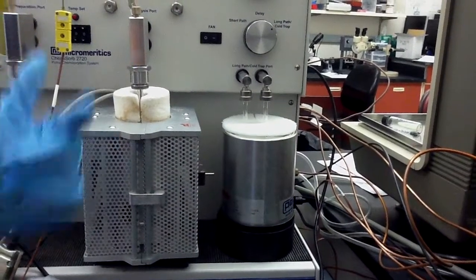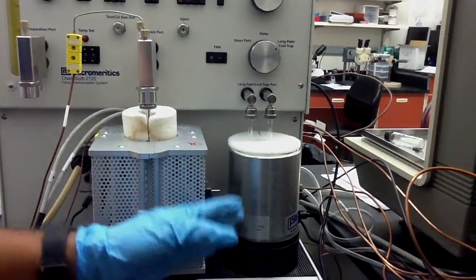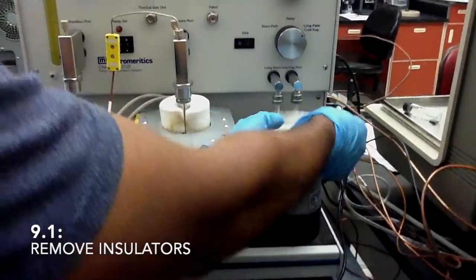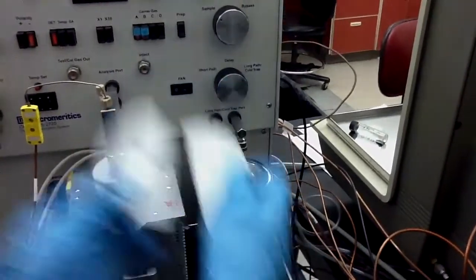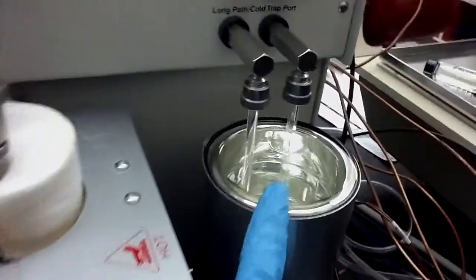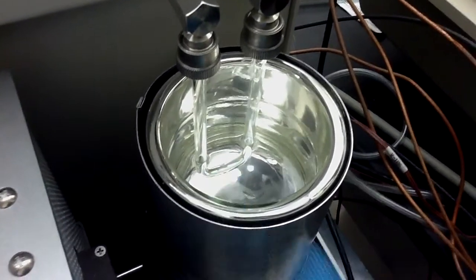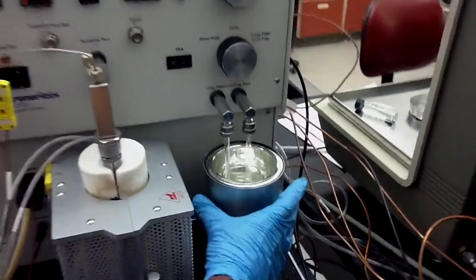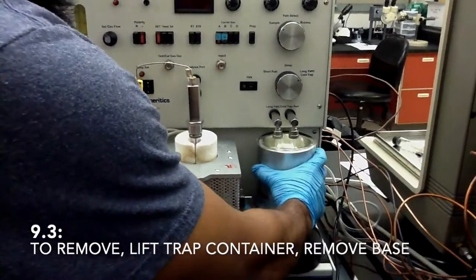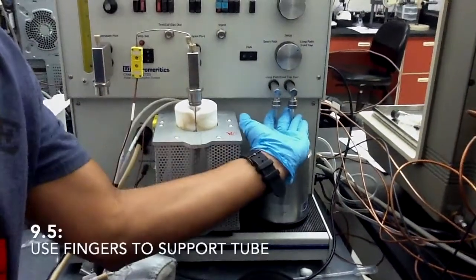When we will be running hydrogen TPR in this instrument, we don't want the water to go inside the TCD detector. So what we have to do, we have to prepare a cold trap. So to do that, take out this tube here. If you look here, inside is already a sample prepared cold trap, which is isopropyl alcohol in liquid nitrogen. And to take this one out, it's the same way you did your sample tube out.